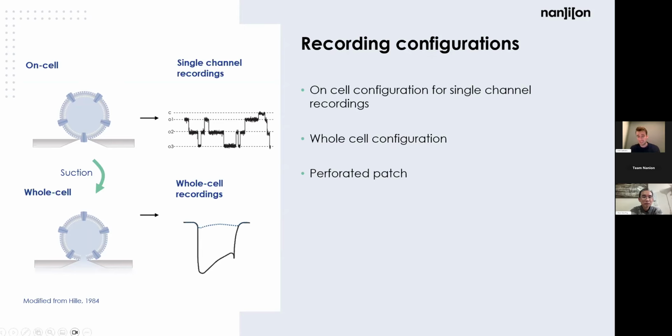Once the stimulus is ended, we can therefore also measure the desensitization or the inactivation of these channels as well.